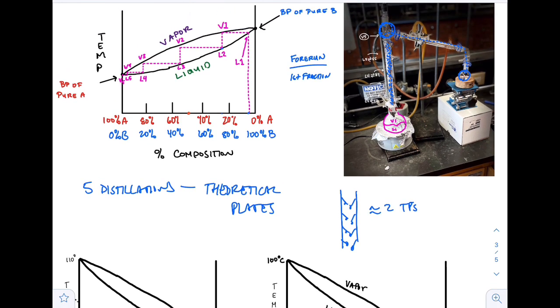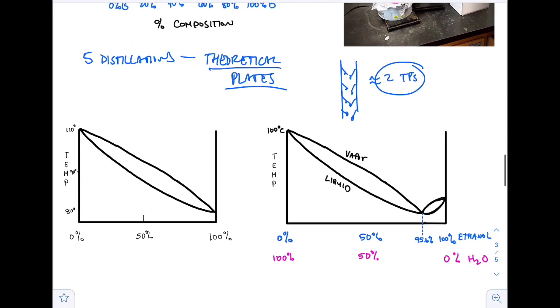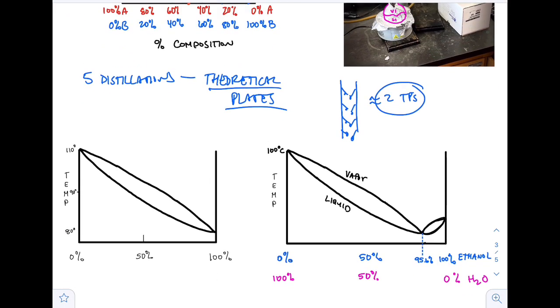The stainless steel sponge inside that column is a little bit better than these 2 theoretical plates, the Vigreux column, but it's not much better, so you'll see the results are like whatever. But the point is, theoretical plates are like the number of simple distillations that might be performed to achieve the same separation. But again, it's only in 1 fractional distillation, so it's super cool.